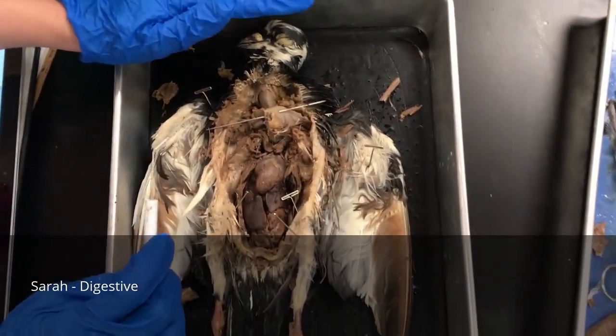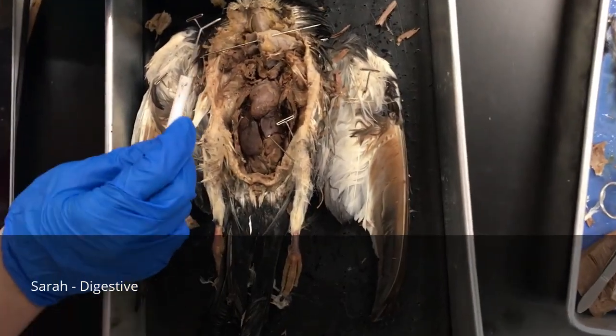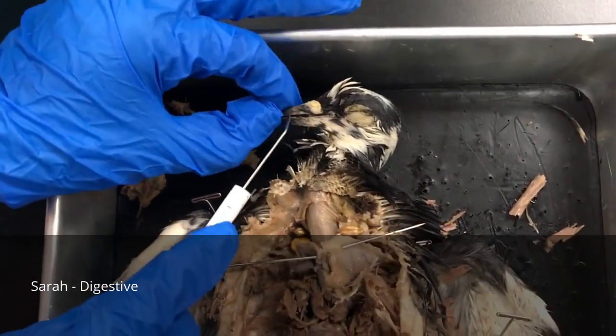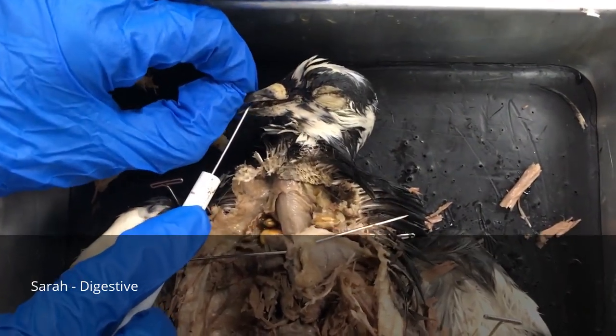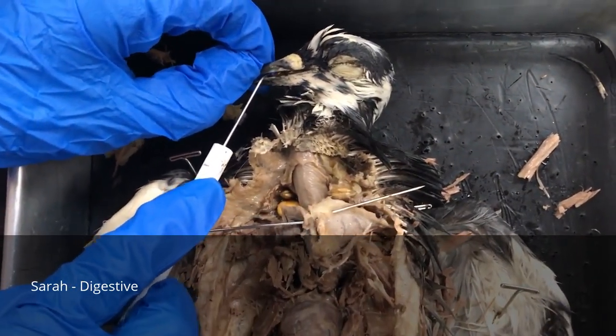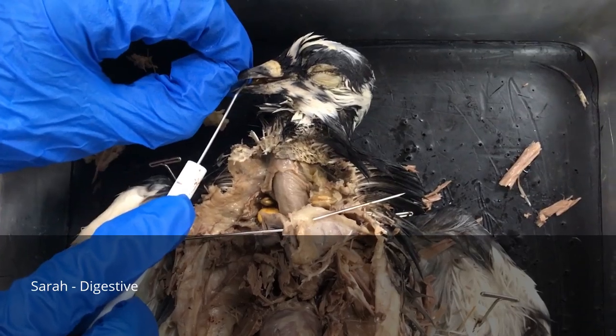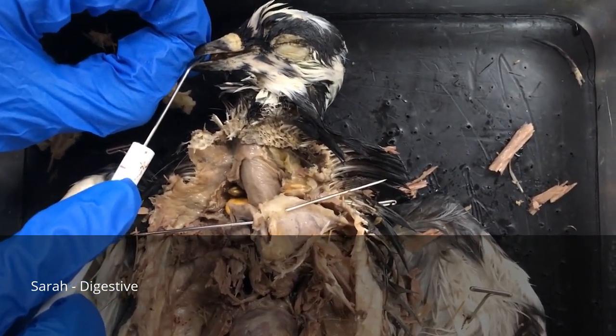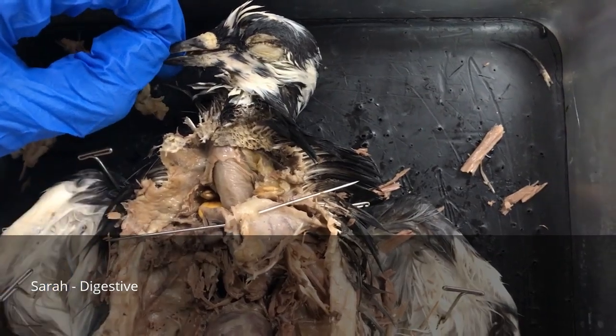We will now be discussing the digestive system. Here on our pigeon, we'll start with the mouth. The mouth has a hard beak, which allows it to crack the seeds and other food that it may eat that's really hard. You might notice that it doesn't have any teeth. That's an adaptive feature that makes it lighter, so it has less bones, and it makes it able to fly better.